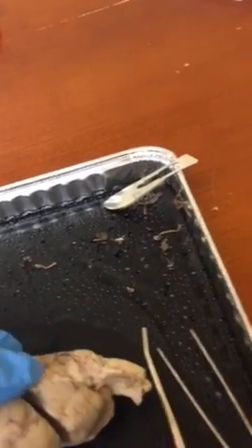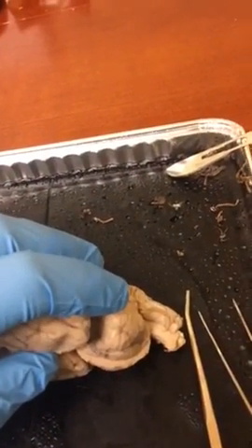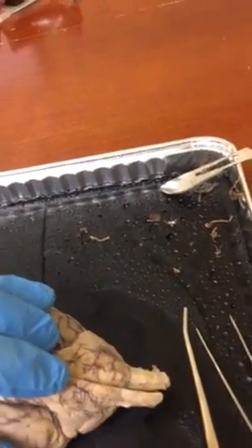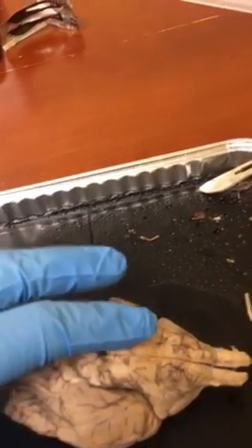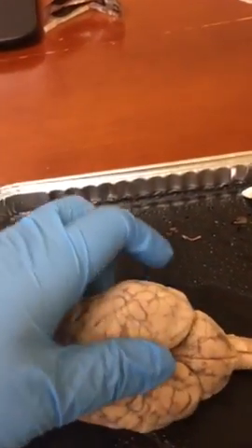And then back here is the cerebellum, and it is divided by the central ridge called the vermis. And this area back here controls muscle coordination. We flip the brain over.